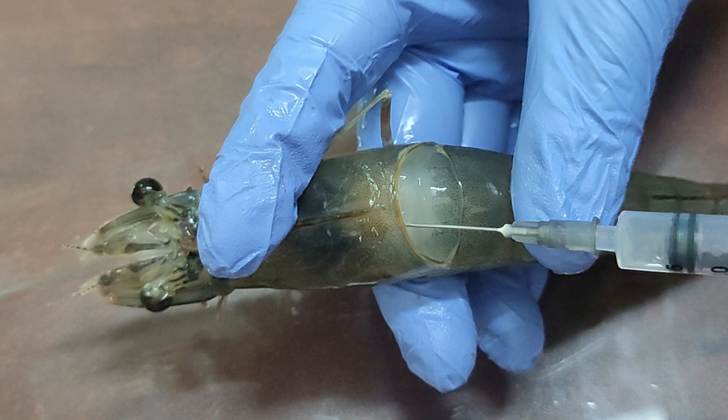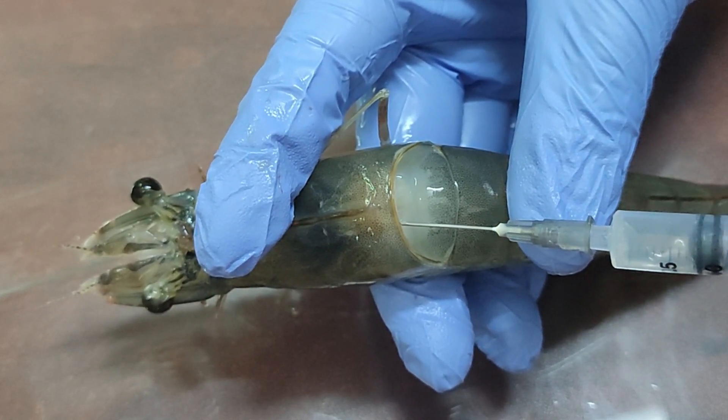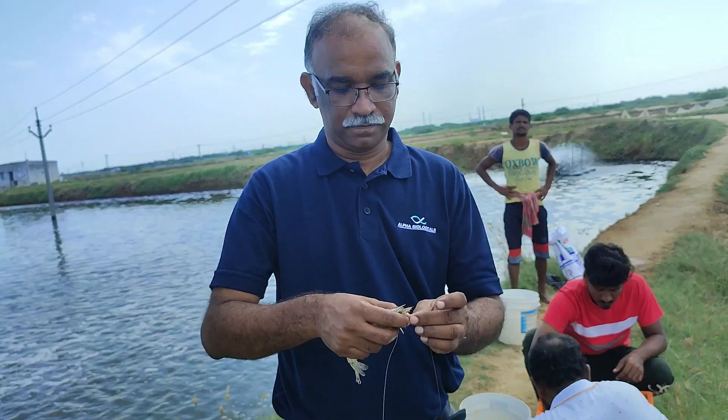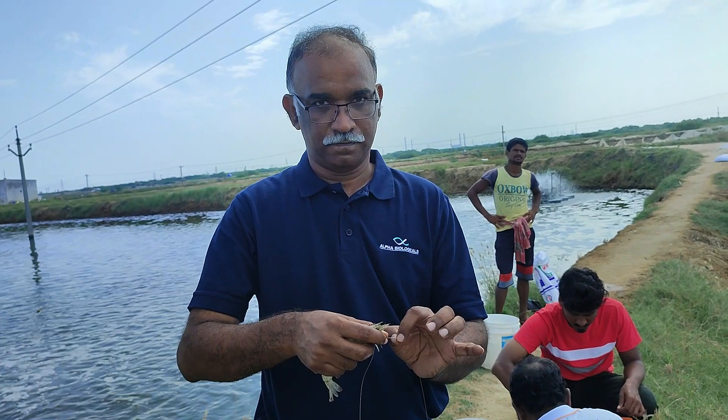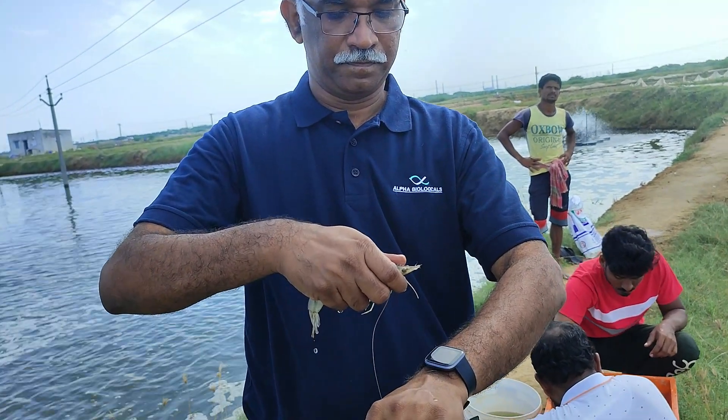The second method is easy but destructive — shrimp survival chances are less after that. The third method is very easy but can be performed with bigger shrimp only: cut the antennae and collect the blood.